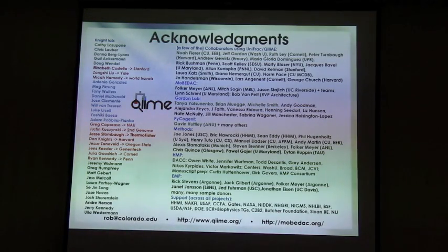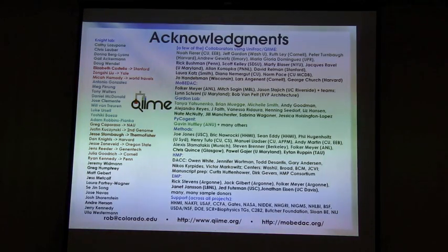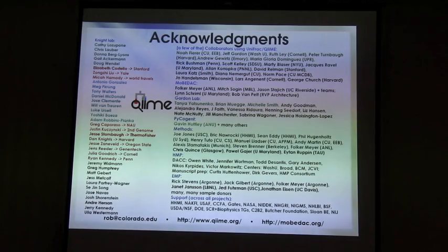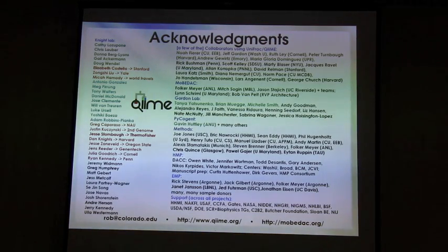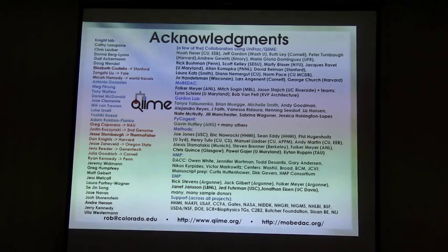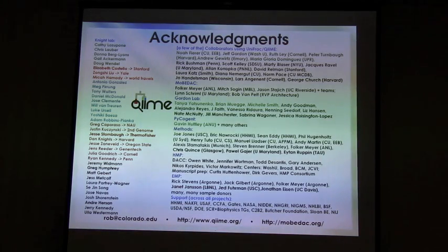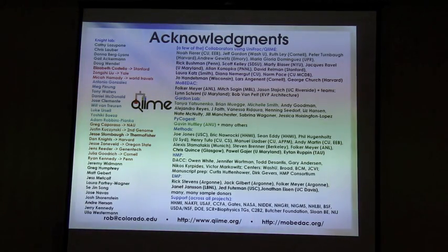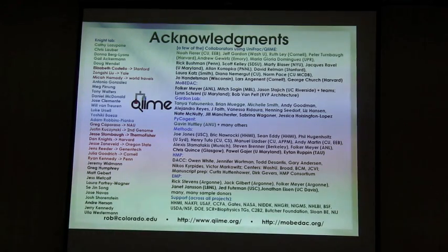Another thing I'll mention is that a large part of QIIME's development has been working with different collaborators on different projects and different data sets, which is what allows us to make it relatively robust in a range of different systems and environments. Part of the purpose of this meeting is to make sure that you know who the people in the group are who are developing QIIME, so you know who to talk to specifically if you're having a problem that you can't answer. With that, I'd be delighted to take a few questions if there are any.